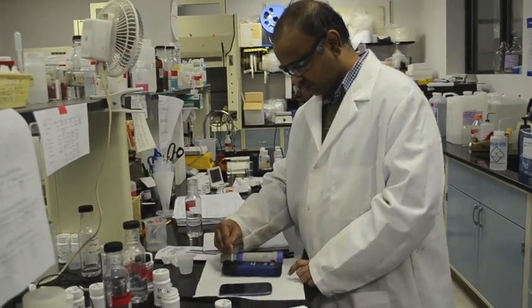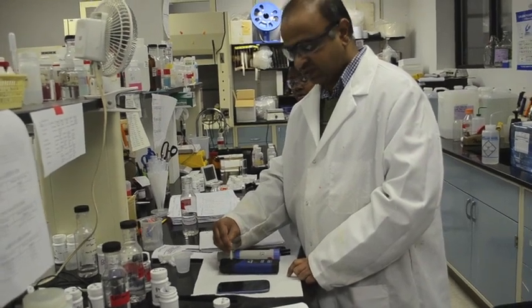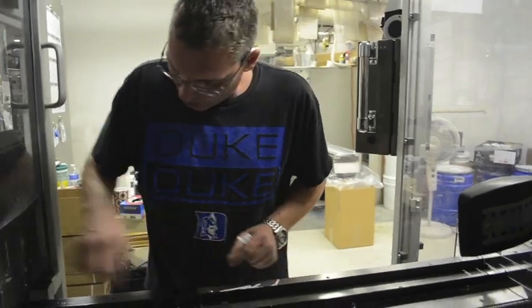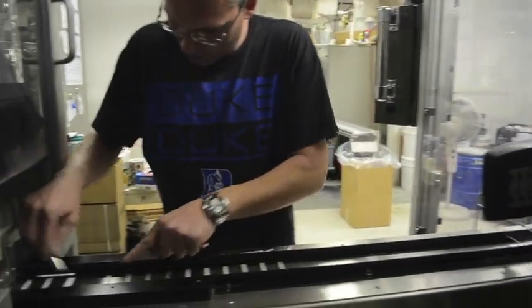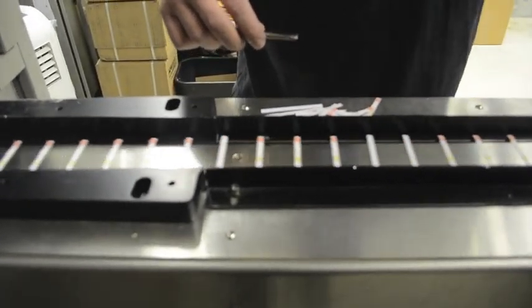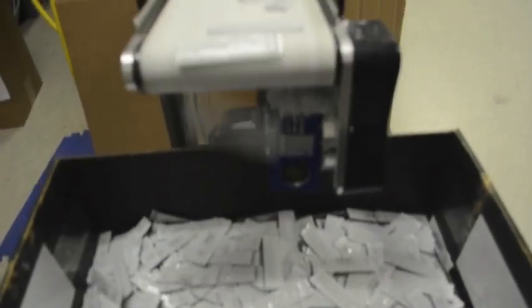It's actually quite exciting to see that we're the only company in the whole world that can do two-way communication between a smartphone and a photometer. Not to mention, all the test results are stamped with time, date, and GPS location, which really provides integrity when doing water analysis.